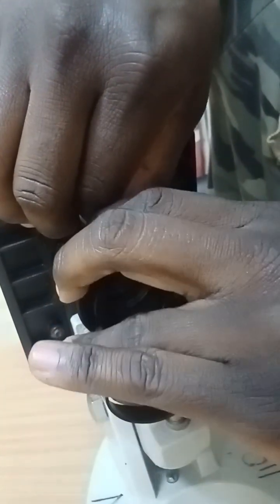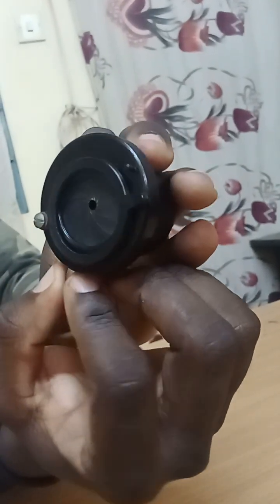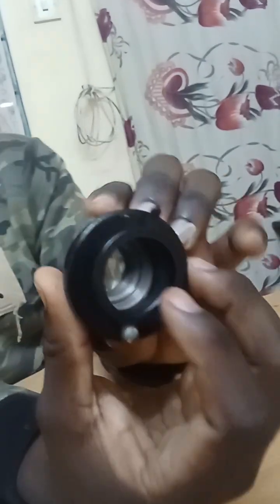We can remove it so as to see this diaphragm and the condenser. And when using the microscope, this diaphragm must be wide open to allow light to pass through the condenser to the object on the stage.